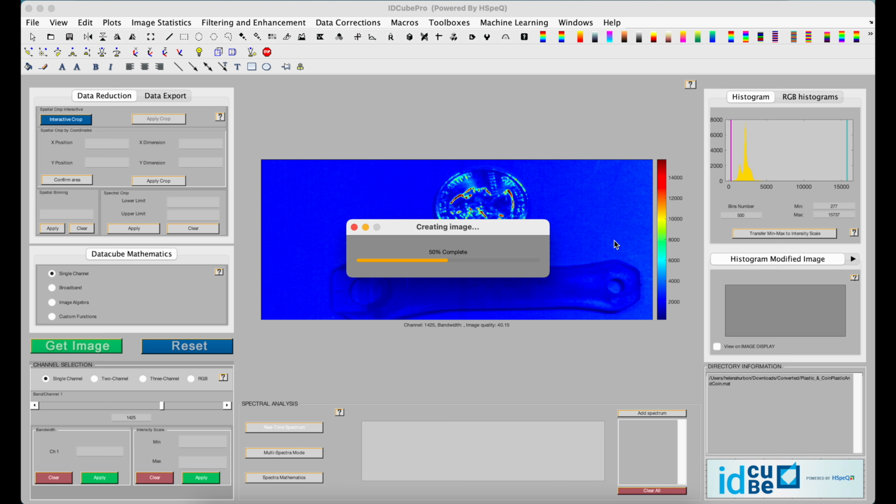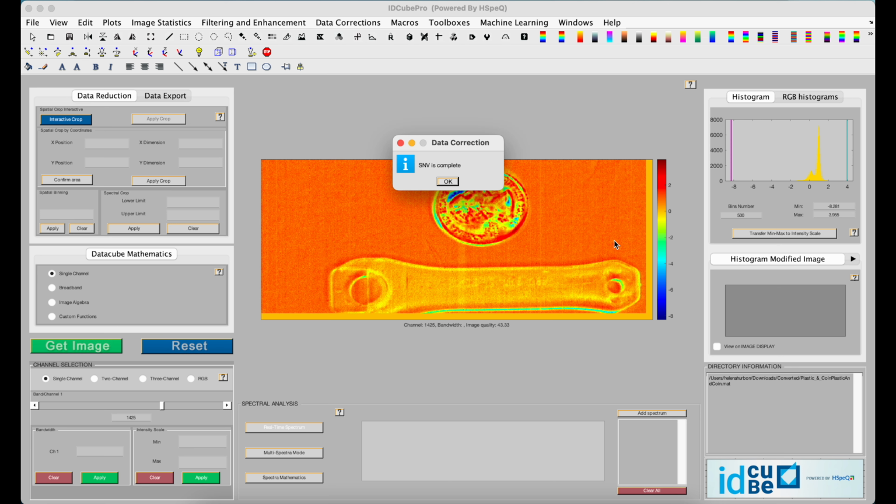The sliding window is a computational imaging technique that uses a small number of pixels in a grid of cells to perform calculations and reduce the calculation time. The grid of cells passes through the spatial dimension of the image. At each pass, the calculation within the window is performed, and the first pixel in the window takes the values from the calculations. IDCube uses the length of one dimension as the window size. The process is now complete.